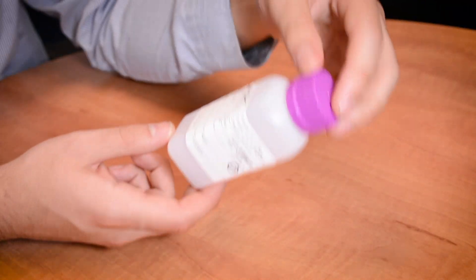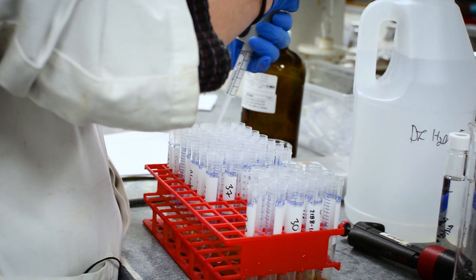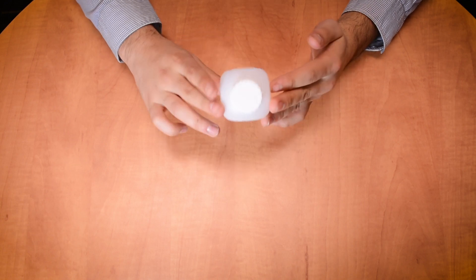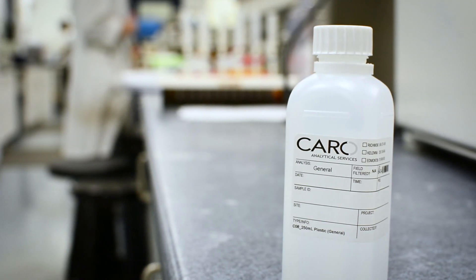Next is the container with the purple cap and it's meant for cyanide testing. The last one, the container with the white cap, is for everything else including pH, turbidity, and conductivity, among others.